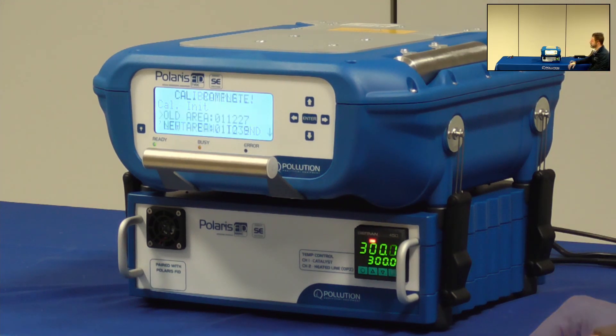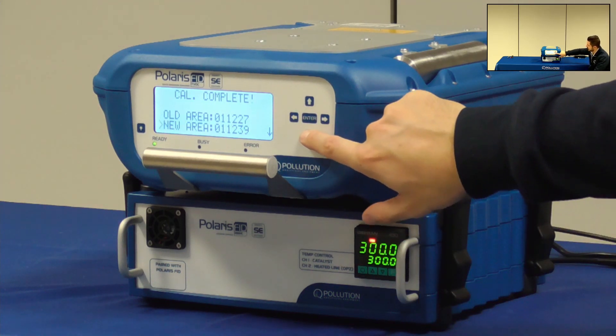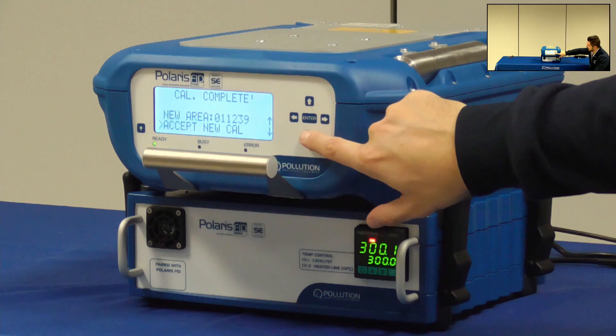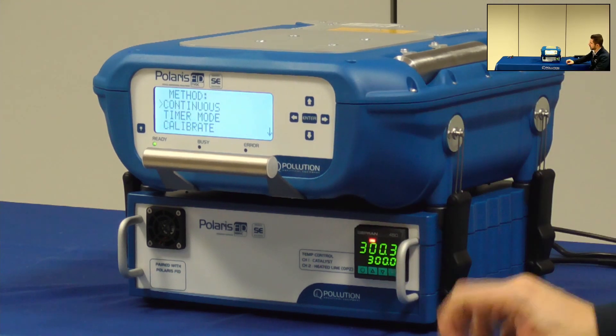At the end of the calibration the instrument will show the old area and the new area and I can choose to accept or not the new value. In this case I want to accept the new calibration, and now this specific method has been calibrated with the proper span gas.